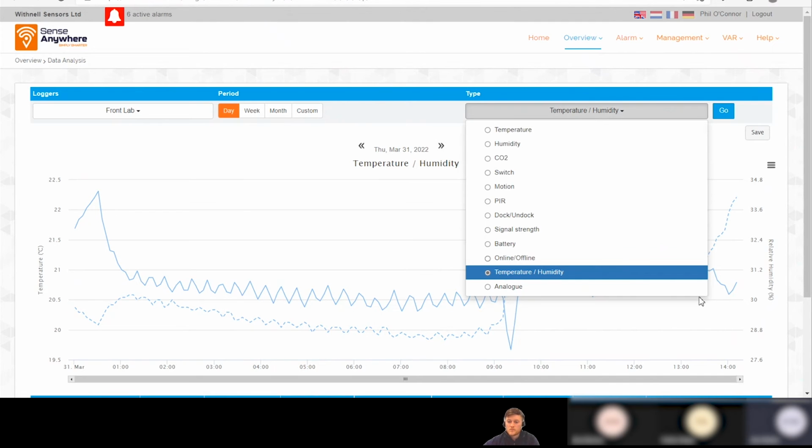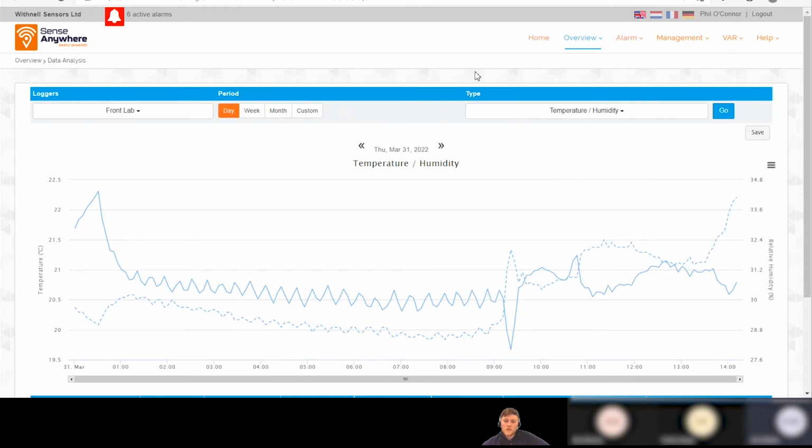Sorry, Phil, can I just ask a quick question there? Sure. We got our demo kit in last week. I haven't had the chance to play with it myself yet. The other guys have, but you said the logger interval was 5 minutes. Can that be decreased to less than that?